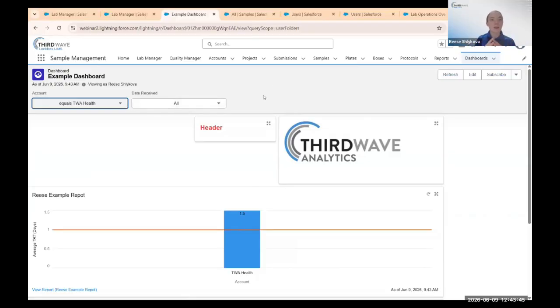With that, that really was a crash course. Like we mentioned multiple times, there's way more kind of advanced features. We can really get into a lot of detail on reports and dashboards, and that's why this really is a learning journey. So the next series in this webinar would be a more advanced look at some of those reporting and dashboarding tools. But our goal with this is that at least at this point, you can create reports, and you can create dashboards, and you can get started with the process of pulling your Lockbox data in and visualizing it and reporting on it.